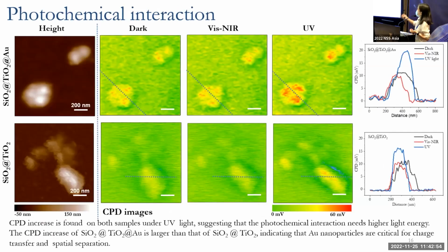Later we try to study the photochemical interaction in these hybrid materials. In this talk, we prepared two samples. One is with gold addition, another one with no gold.